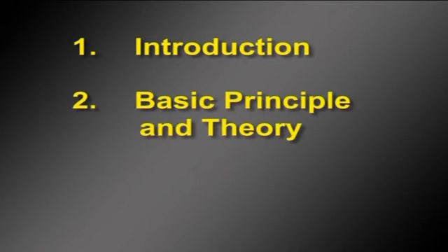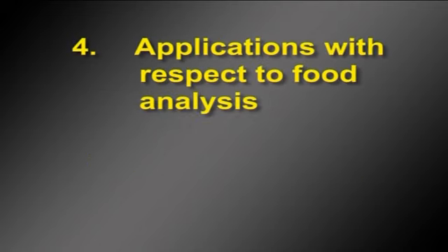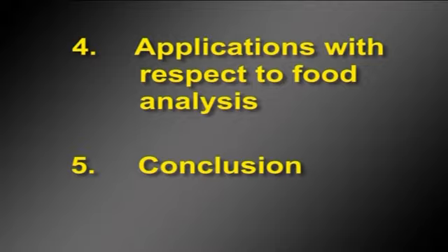In today's lecture deals on the topic entitled Spectrophotometer. The present episode consists of following 5 sections. They are Introduction, Basic Principle and Theory, Instrumentation, Applications with respect to food analysis and Conclusion. Let us see one by one.